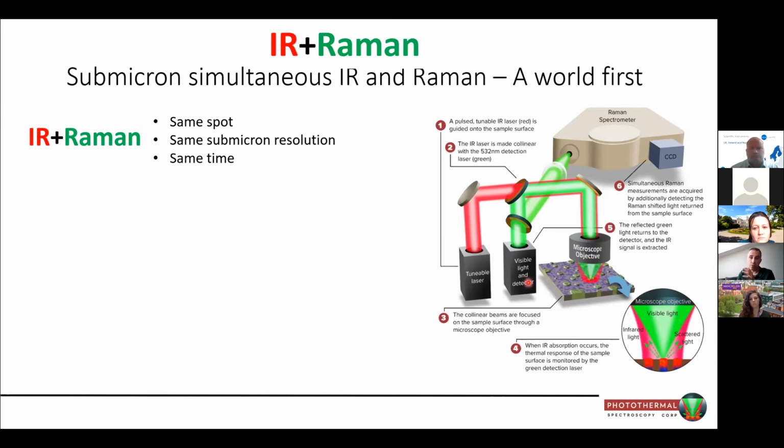But any of the Raman scattered photons, remember, there's always Raman scattering happening, whether we like it or not, whether we want to use it or not. The photons are being scattered via the Raman effect. And in this case, we're simply taking advantage of that using a dichroic filter to send those to a Raman spectrometer, and the unscattered, or the Rayleigh light, goes straight through to your visible detector.